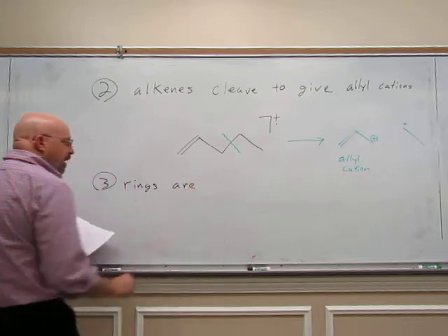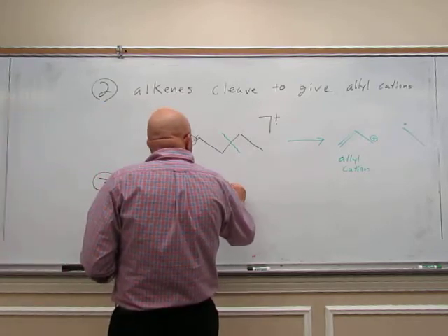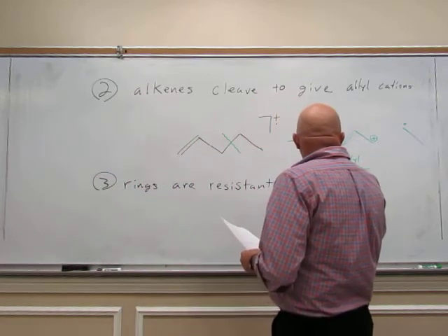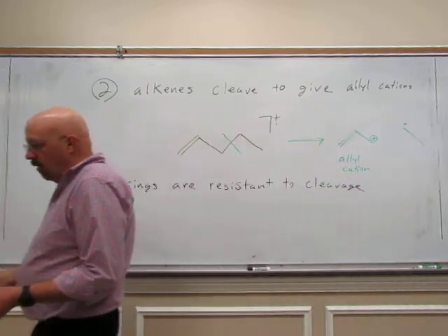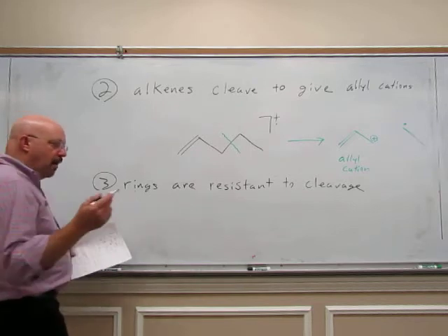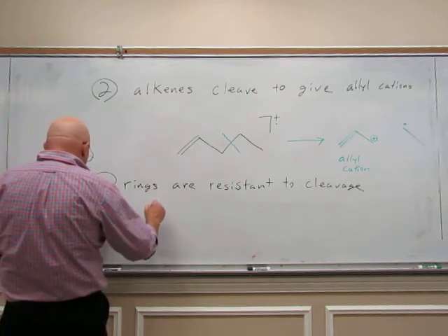Our next one deals with rings. Rings are resistant to cleavage. We don't like to break a ring apart. Rings are very, very stable. For most rings, we like to cleave right next to the ring.